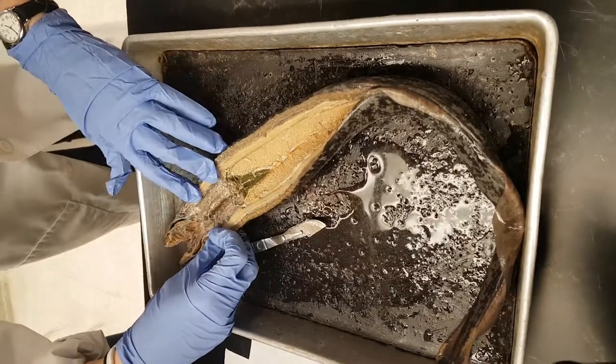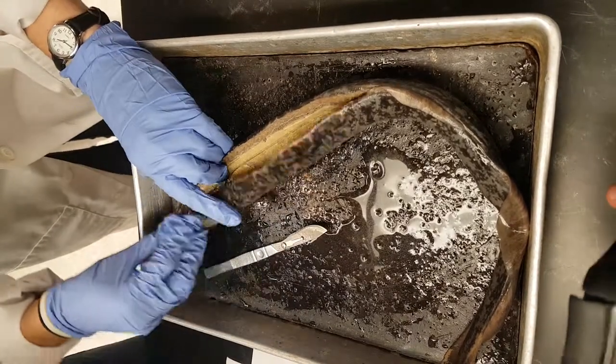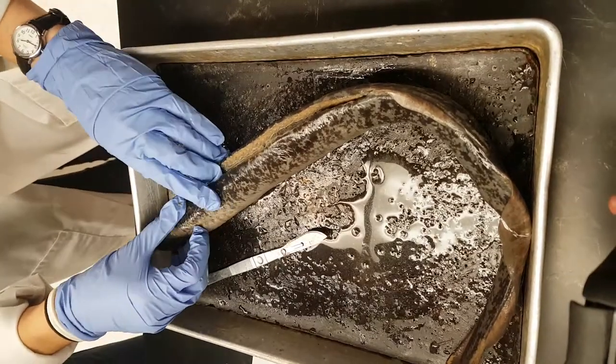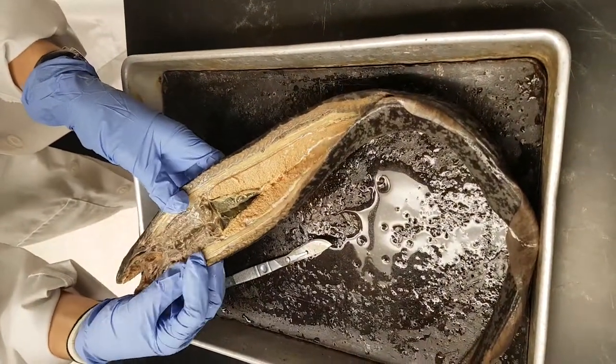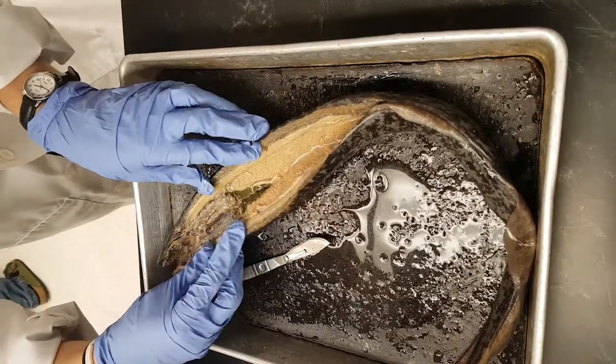Your internal gill slits are a little hard to see in this lamprey because it's old, but those would be here, basically on the interior portion of where your external gill slits are. Your esophagus is also kind of hard to see — I kind of cut through it. It's dorsal to the pharynx.